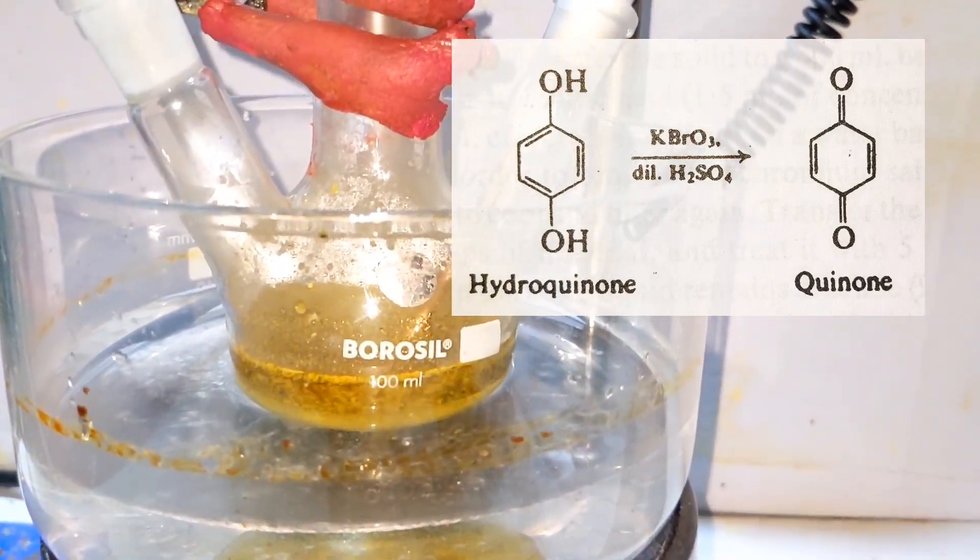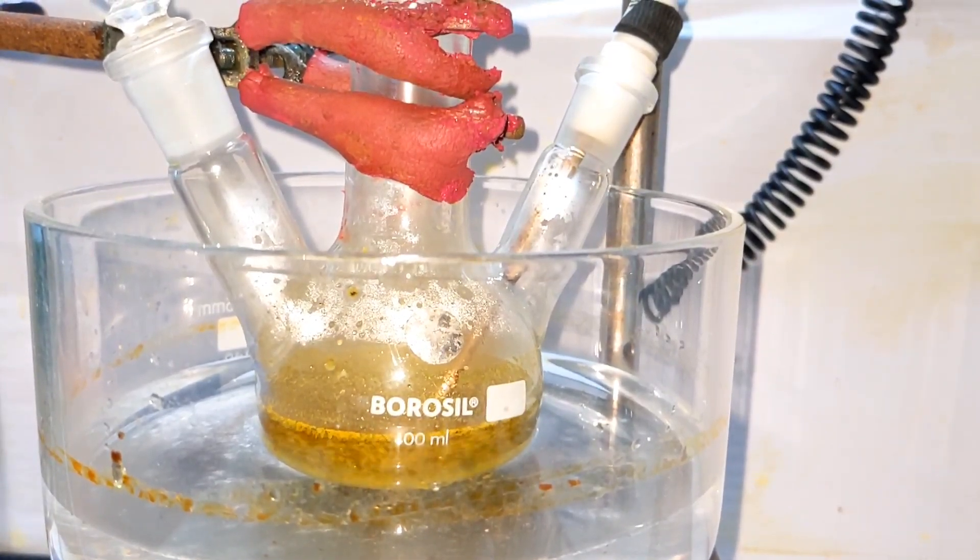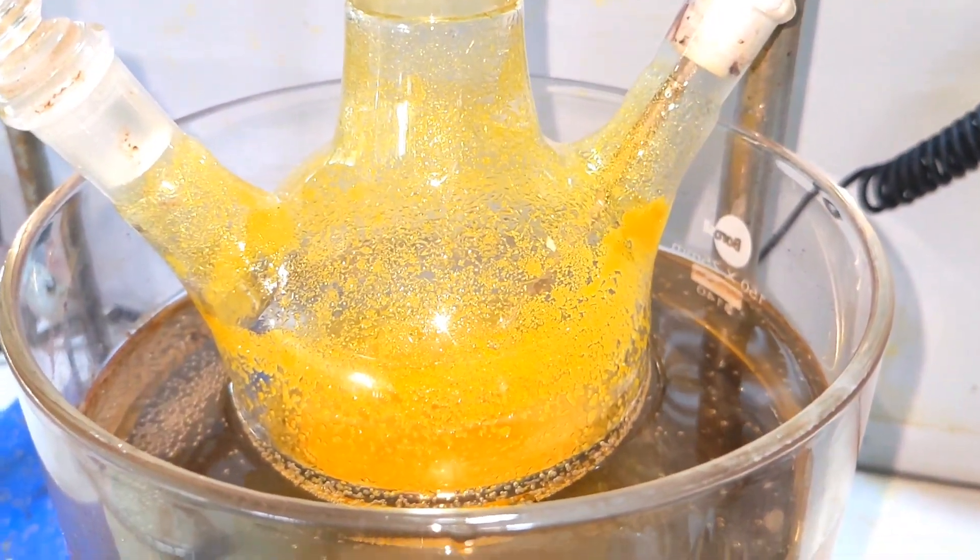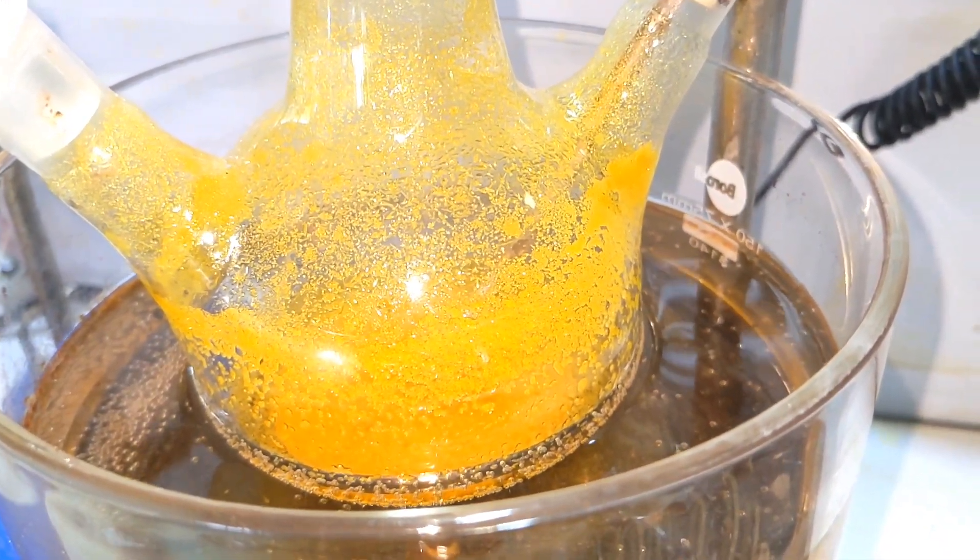Now heat the reaction mixture at 80 degrees Celsius for 10 minutes under reflux to ensure complete reaction. By this time the contents of the flask will have a beautiful yellow color to it.